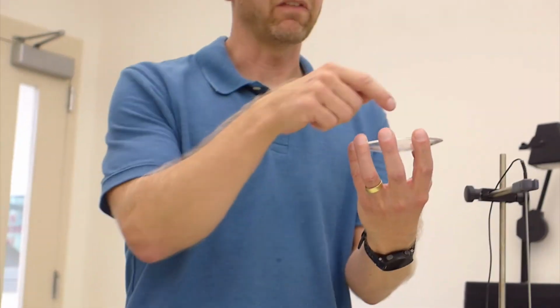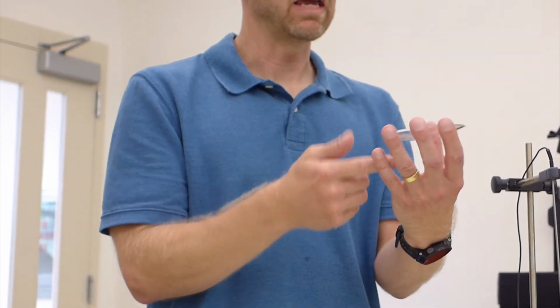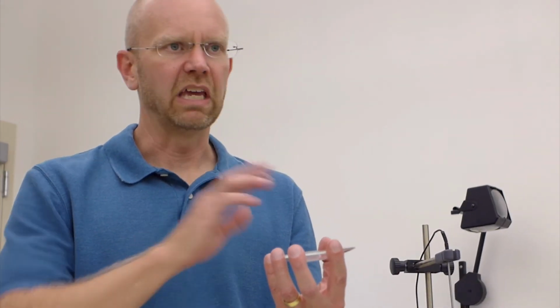So then, once I find a solvent that I add at room temperature, and it doesn't immediately dissolve, or it takes a long time to dissolve, it's only slightly soluble, that's a good candidate, right? And then what you can do is you can take a little heat gun, or even your finger, or maybe a hot plate, and warm it up just a little bit and see if it goes in, right? And if it goes in at high temperature, but then it drops out at low temperature, that's the perfect solvent, right? So initially the first test is make sure it's not super soluble right at room temperature.